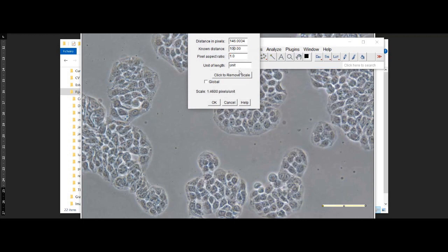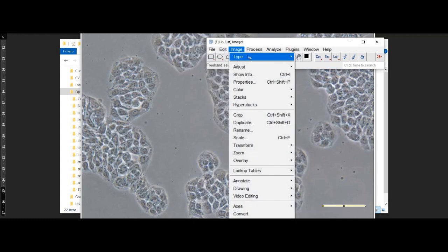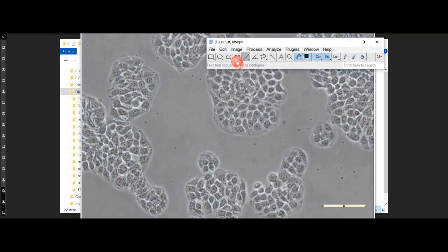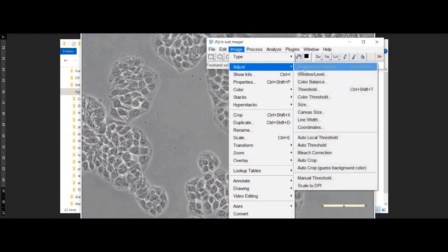Once we have the scale set, we need to adjust the threshold to highlight the cells in our image. We can do this by adjusting the threshold levels until we see only the cells that we want to count.